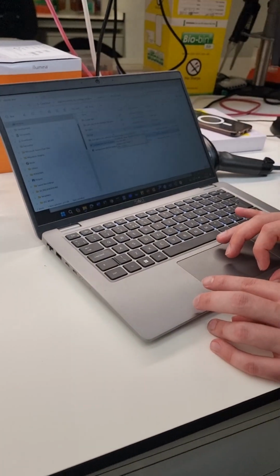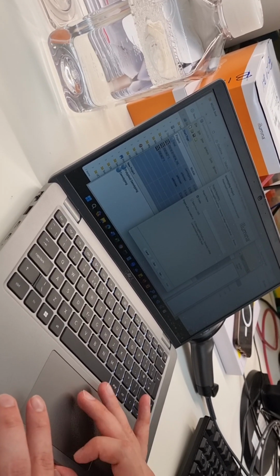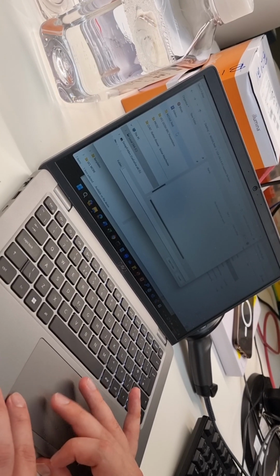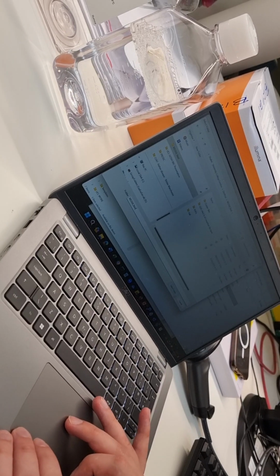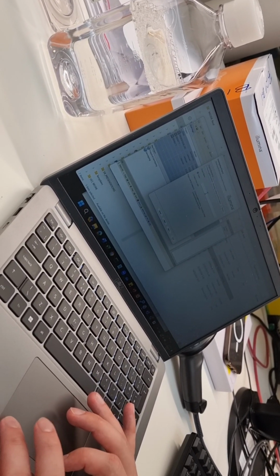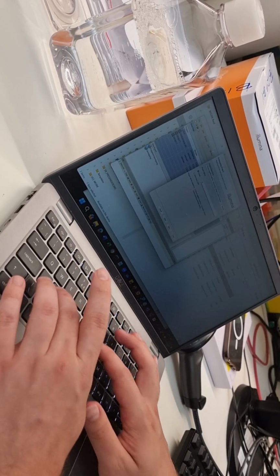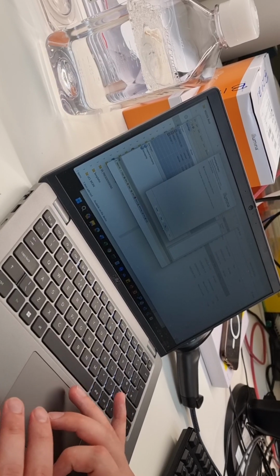The numbers should be fine, so they just correspond to that one in the IDAT file. So that's GenomeStudio. Then for genotyping, next, I'm going to change that to Desktop. That's the one. There, we select the folder. All you're doing now is placing the GenomeStudio file into there, and we'll call it GenomeStudio, and I'll stick my initials there. Next.